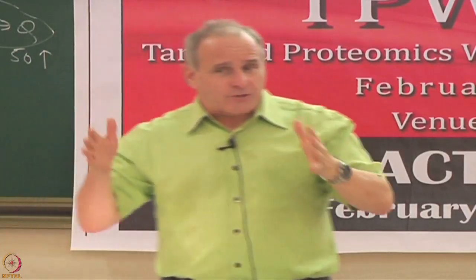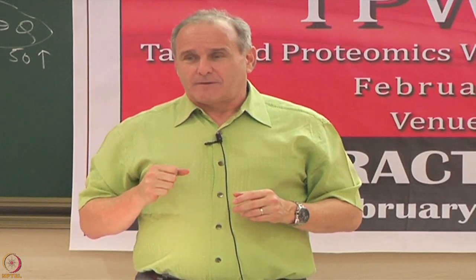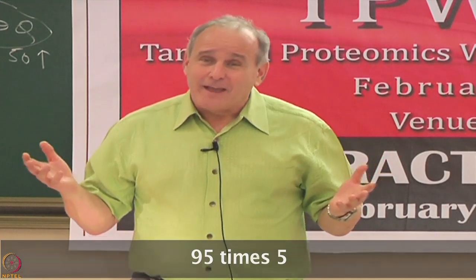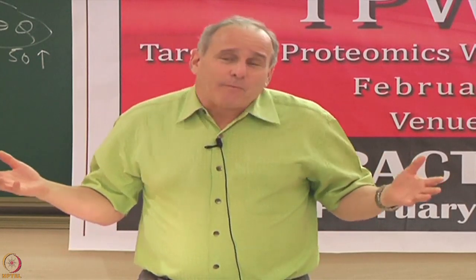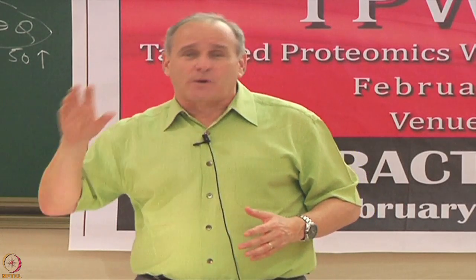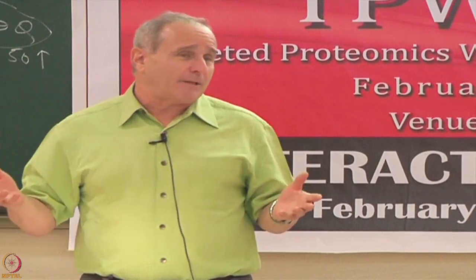Now, let's go to the other extreme. Let's imagine for that 100 spot array that 95 spots light up. How many potential targets do I have? 95 times 5, right? And so how many spots am I going to have to do the next day? Pretty much as if I had started with 5 arrays, each one with 1 spot each. So I'm back to doing the same job I would have done if I had not multiplexed.